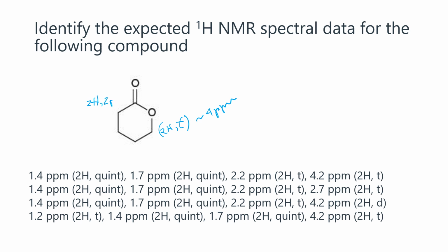This again is approximate. You have the charts. So now, what did I say? It is a triplet, 2 H's triplet. And now this one here is complex, it couples to that. Here in the answers, notice that it says quintet. So it's adding 2 and 2, 4, to give a 5. So you should predict that this is 2 H's and it's a quintet.